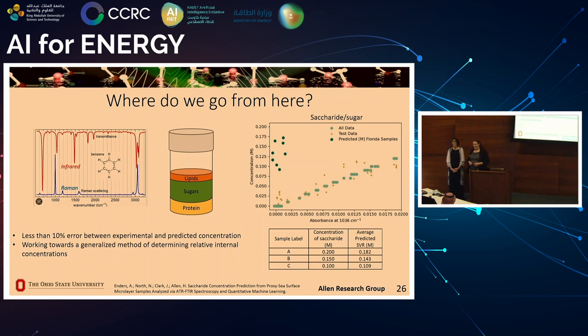Thank you, Professor Allen and Nicole, for a great talk. So you talked about your interest in turning it into a regression problem. Have you tried doing regression on the same problem to get the percentages of functional groups? And if not, what challenges do you foresee in doing that? I was going to say, that's something that we haven't tried yet that would be interesting. The number of functional groups that each molecule has, like, for example, how many alcohols it has, is information that we have access to in our labels, and that would be something that we could try.